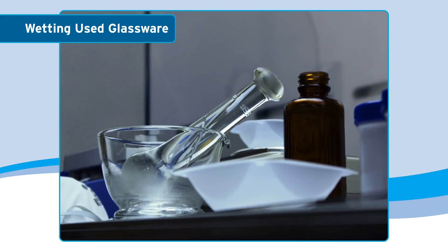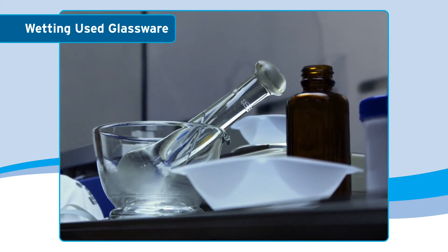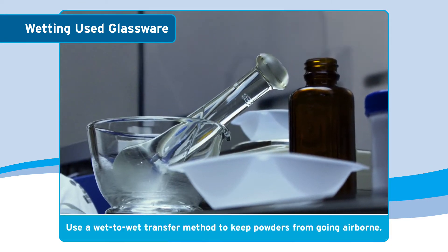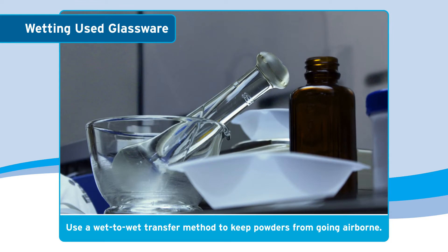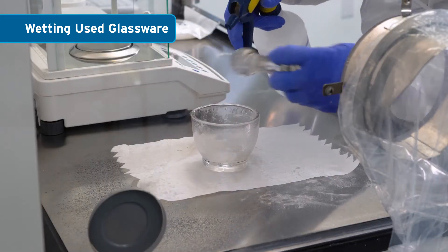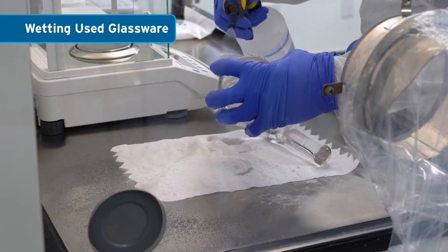Glassware and utensils used in the manipulation of powders should be handled with care before being removed from the CVE. A wet-to-wet transfer method involves spraying down glassware, utensils, and other equipment that have powder residue to keep the powders from going airborne, which would create both a personnel and environmental exposure.